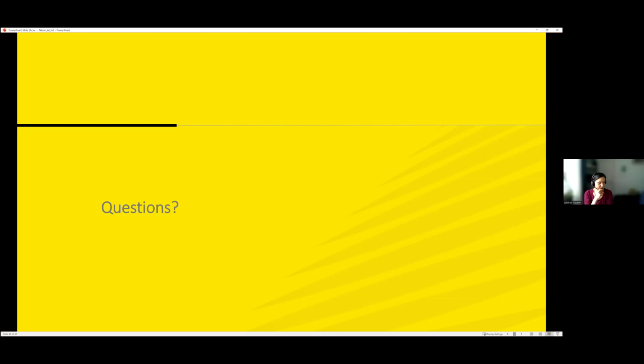I can see several projects that we have amongst the students who could benefit from what was presented, in particular Emma maybe with live cell imaging, where it's challenging to find the imaging conditions that do not create too much noise, and that could be something interesting to try.